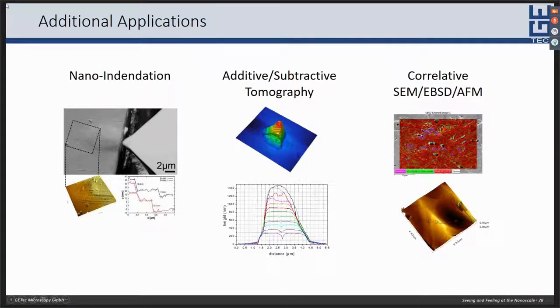I hope in this webinar all of you gained important insight into the variety of new possibilities which arise due to the correlative analysis capabilities of the AFSEM in an SEM. If you have your specific AFSEM application in mind, feel free to contact us anytime for in-depth discussions. We will then help and support you in the best possible way with your application. Having said this, I'd like to hand over to Chris again, who will briefly summarize this webinar.